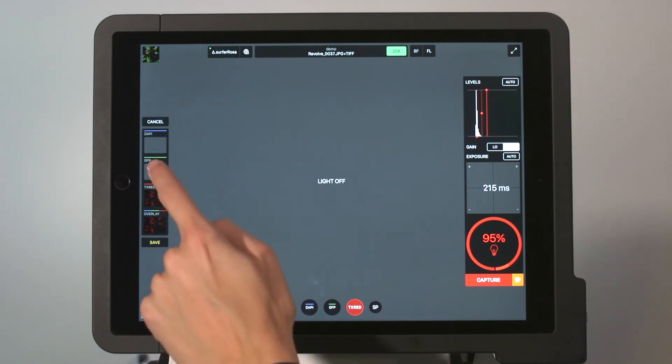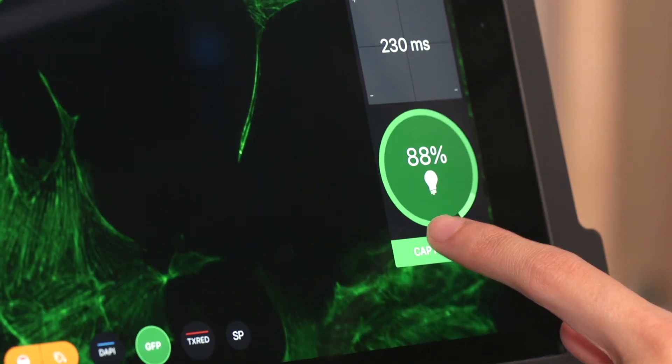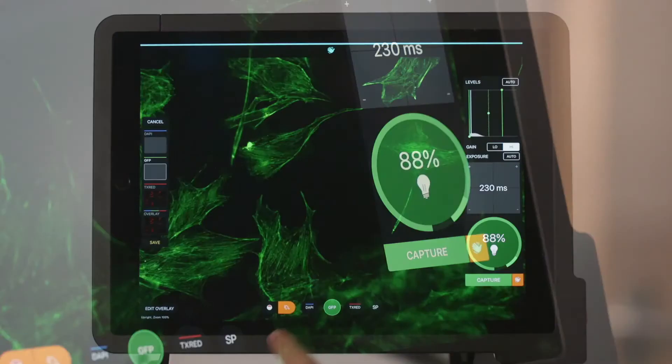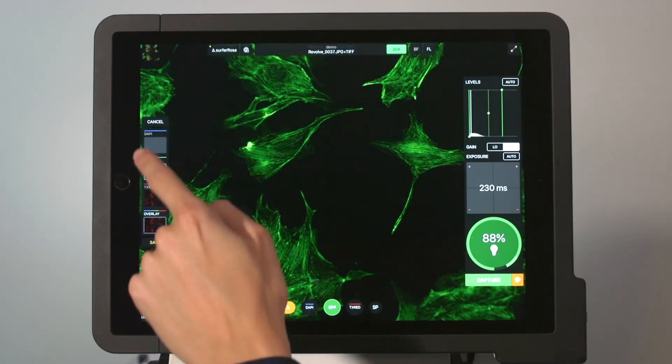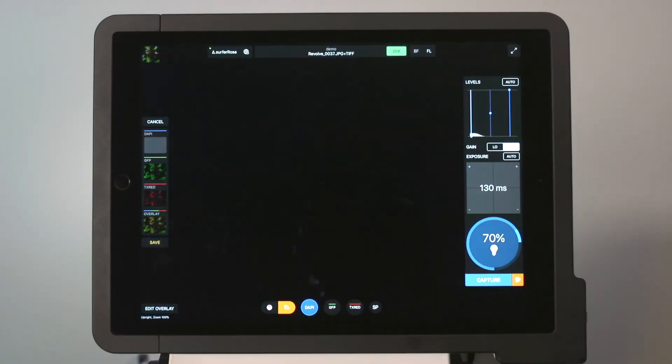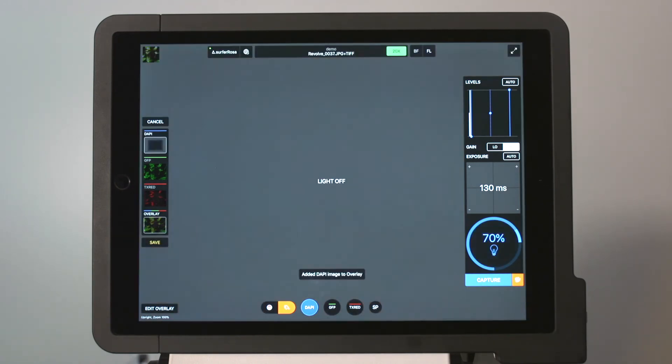Next, we'll capture our GFP, and we'll finish up with DAPI. And just like that, we have our completed overlay.